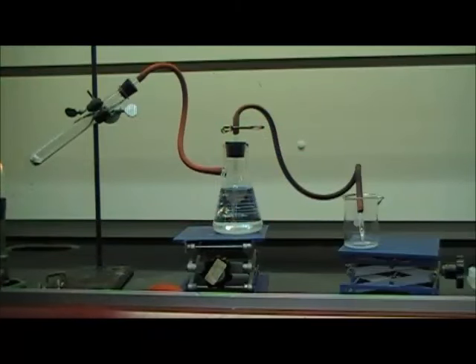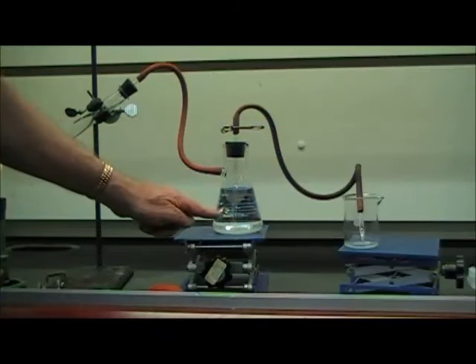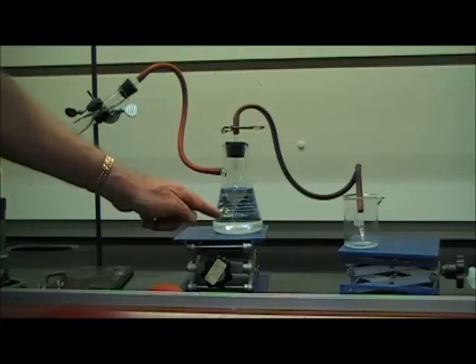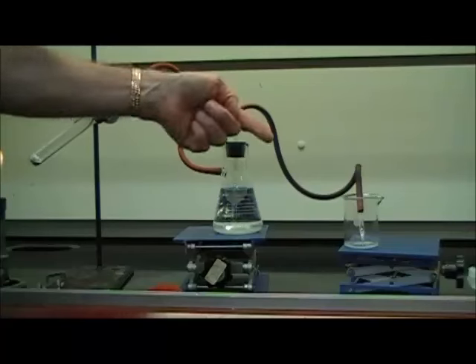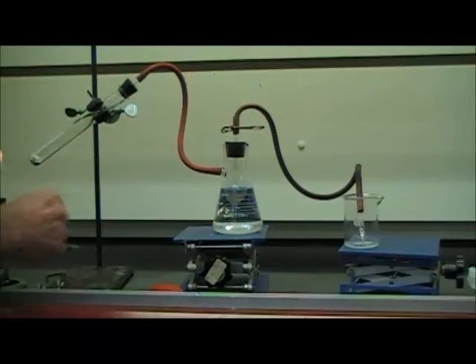over into the beaker, but we want to make sure that the water level in here never goes below the bottom of that long tube that's inside that flask. If it gets below there, air will get up inside, and we don't want that to happen. We want to trap it all in this area.